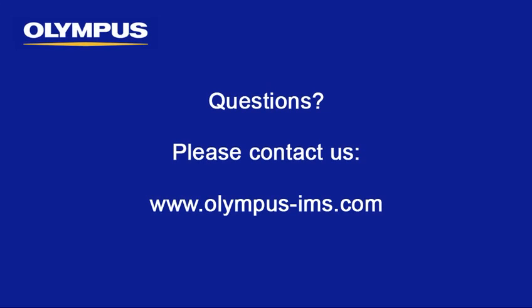In this instructional video, we have covered automated MIA within the Olympus Stream image analysis software. We hope this video has been beneficial, and we invite you to contact us directly with any questions.